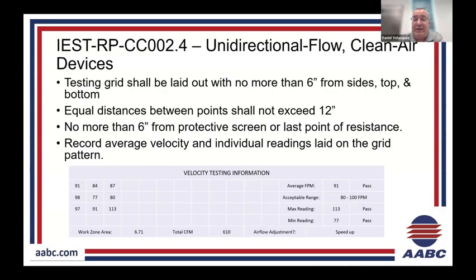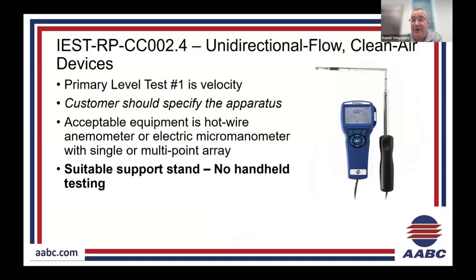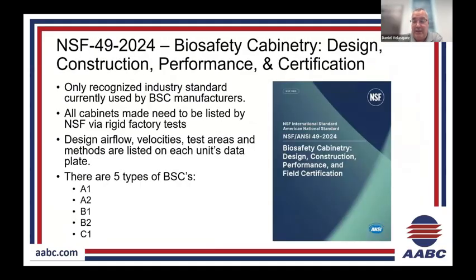That's how they keep the areas clean. They'll have the work zone on a laminar flow bench, such as the one in the middle. You see the nice surface there? They'll work about 12 inches away. So they want to know that it's nice and clean. So it sweeps all the particles away and it prevents infiltration from the surrounding areas that aren't ISO 5 classified.